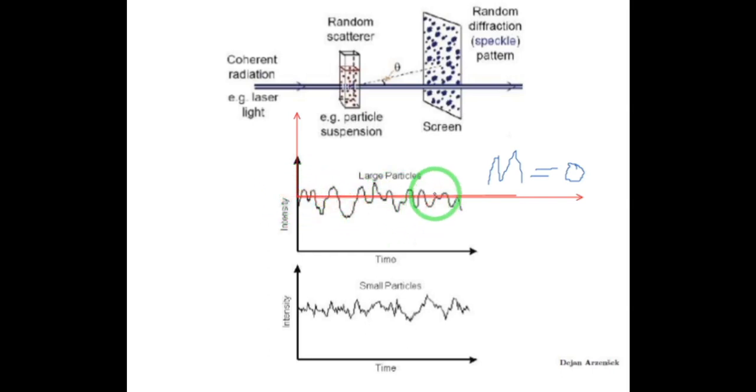In both cases, the mean value is going to be the same. So I will write it down here for you. This is called the stationary statistics.